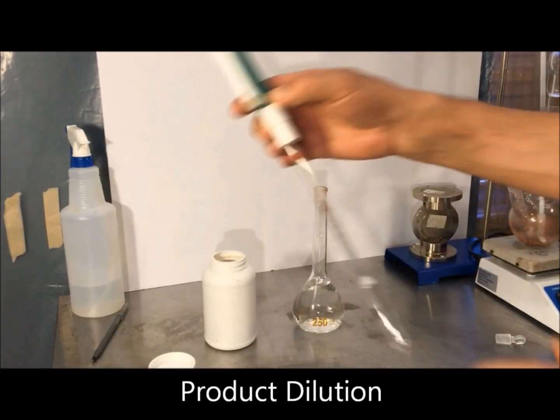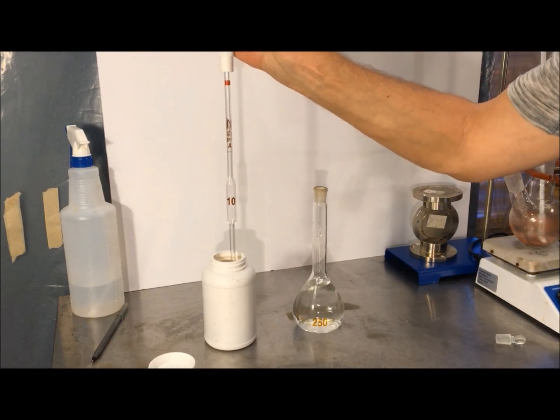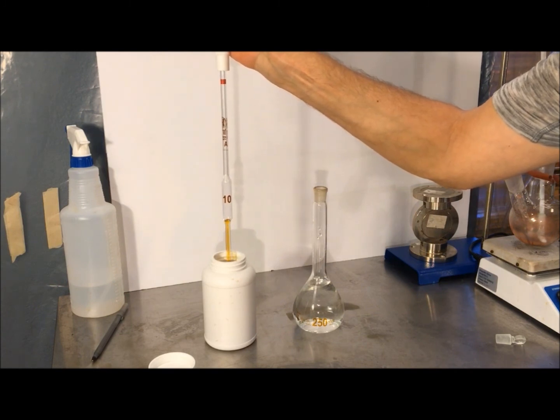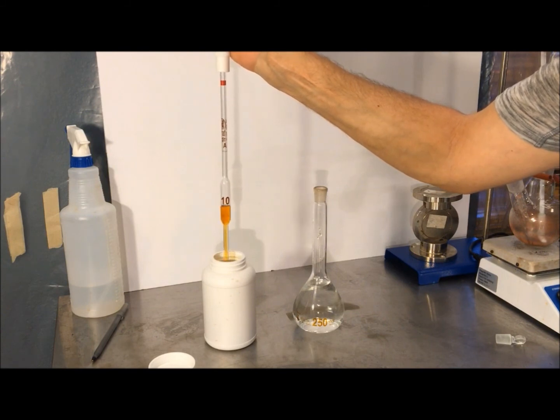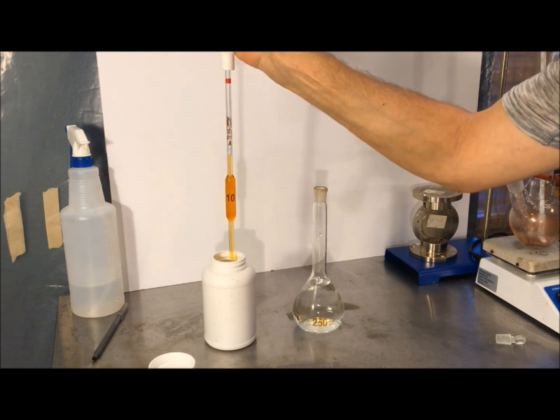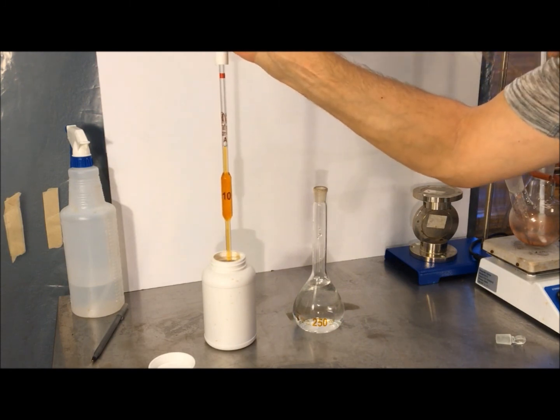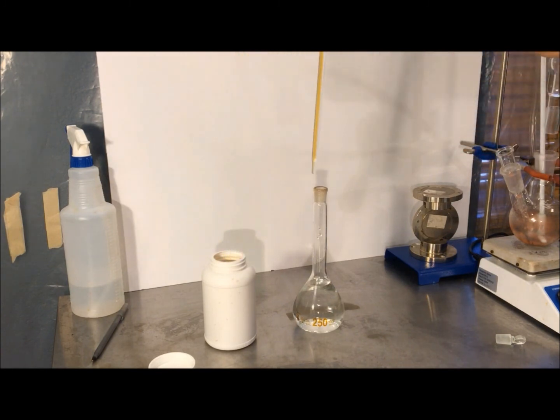Another thing you'll need to do before testing and using the product is to dilute it down to some sensible concentration. The papers I read used anywhere between 10 to 30 parts per million to test it against bacteria and fungus. So I'm going to go ahead and dilute this product 25 to 1 with distilled water. And that'll serve as kind of a stock solution for testing.